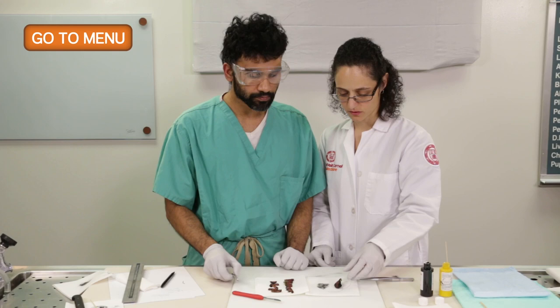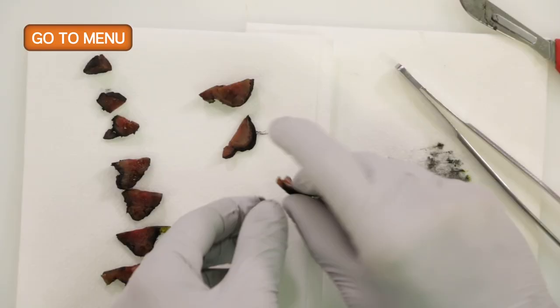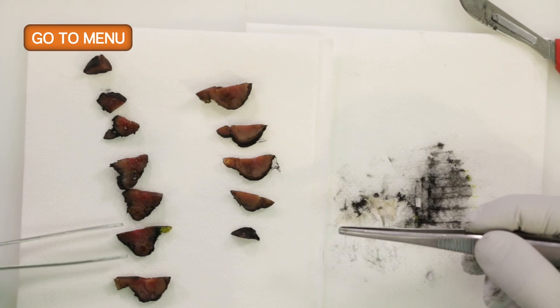So I'll just put this aside. Right, so we're looking at the lesion again. Yep, this is the other half again. Correct. You look at it, it has, again, a pretty well-defined border. And I don't see any other lesions in the remaining thyroid.